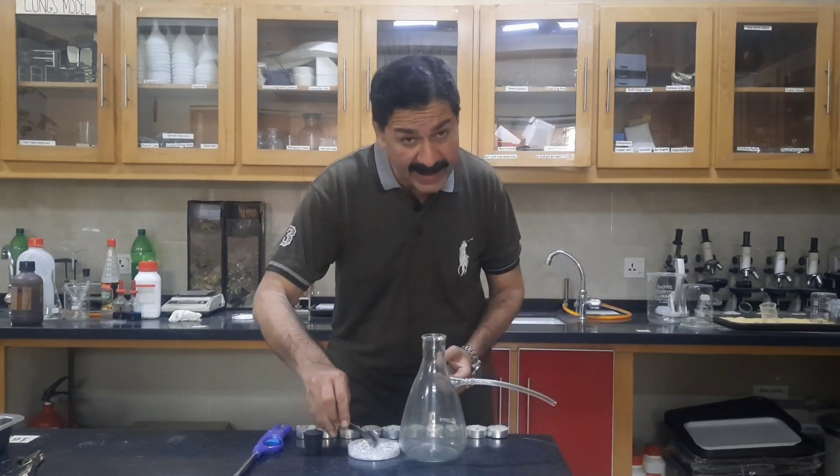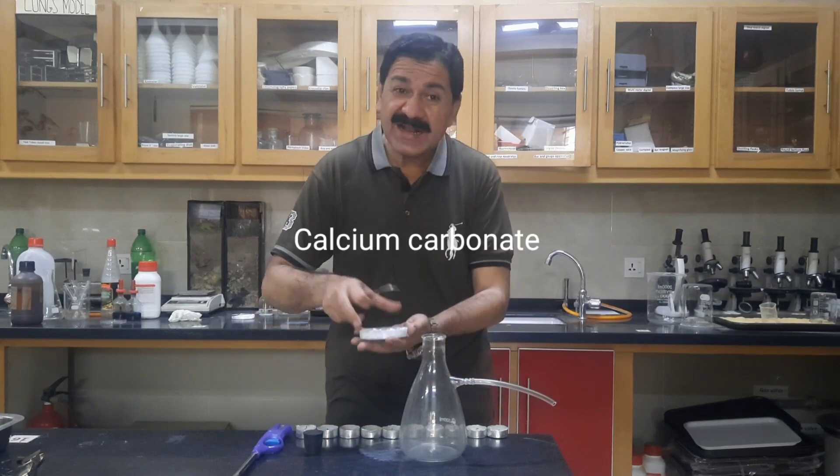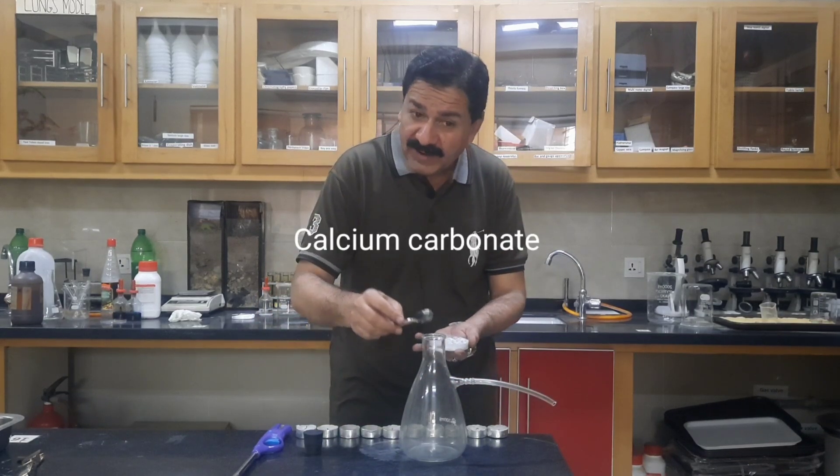So first of all, I am going to add 2 spoons of calcium carbonate marble chips in the flask.